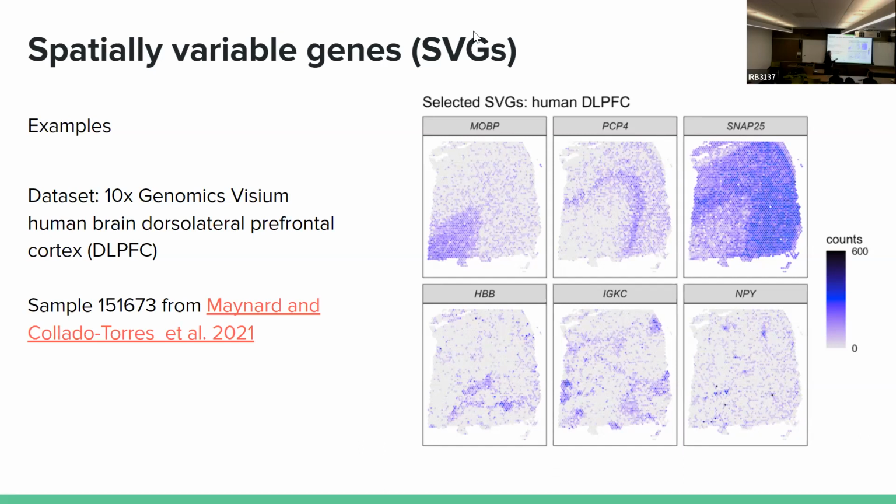So it can be anywhere between 0, which is typically neuropil in the brain, for example, to maybe 10 cells per spot. And it's a mixture. So then the question is, if I have single cell profiles, similar to single cell data that I want to deconvolute from a bulk tissue sample, can I deconvolute each observation and imagine having a little pie chart at each one of these spots? And that's actually what people show. You can see inhibitory neurons, excitatory neurons, white matter, you can see that type of information recovered. But it's mostly proportions.